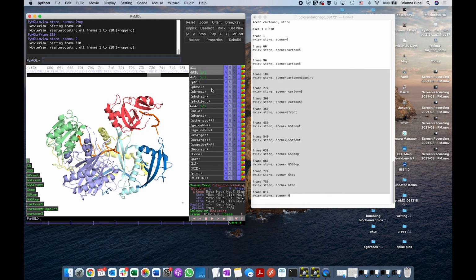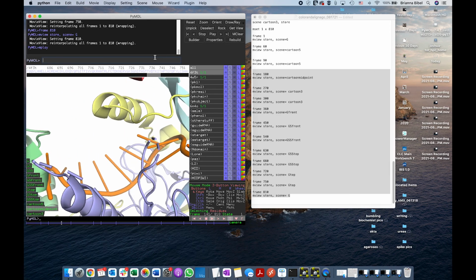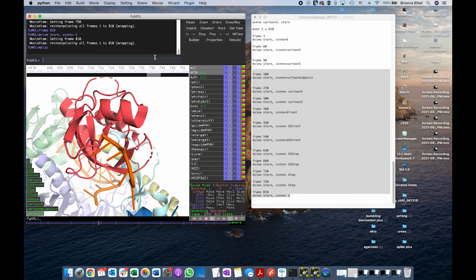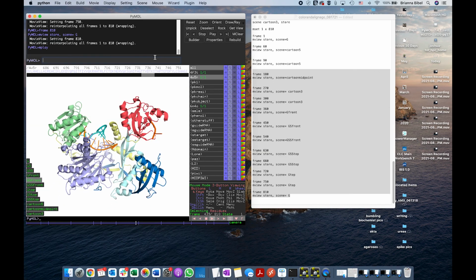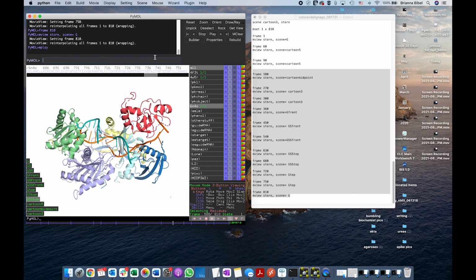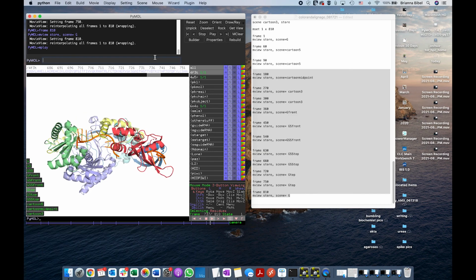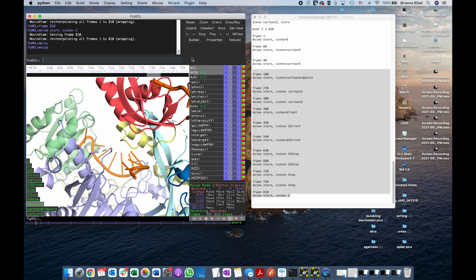So to play this, let's go back to the beginning, and we can do mplay, and it'll start playing. And we can check it out and see if it's what we wanted. Okay. And then you can do mstop to stop it. It'll just keep going over and over.